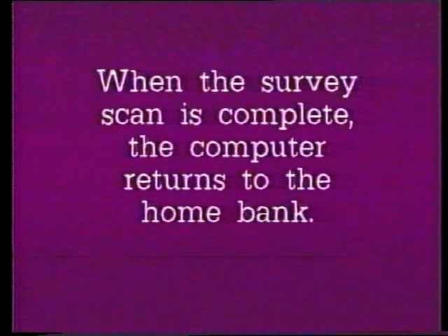The survey scan is now complete, and we return to our home bank. To display the survey scan, we press function key number 16, which will display last acquisition.